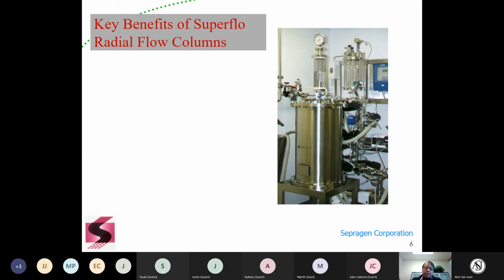And people have made these changes on columns. You don't necessarily have to develop it in PD, but these changes have been made in later stages of clinical trials or even post-approval. Not a very difficult change.